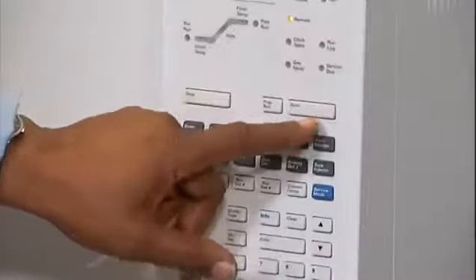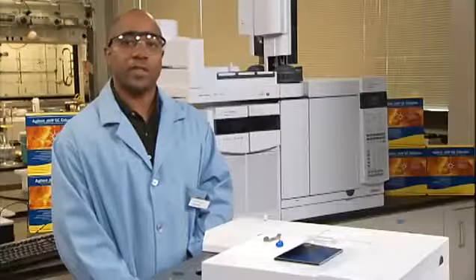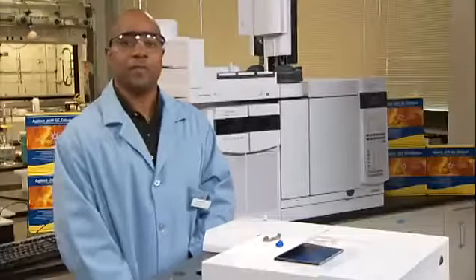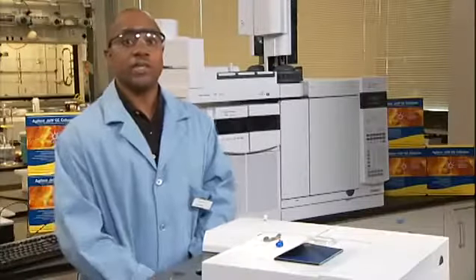Slide the locking tab to the back. Turn on the inlet. Allow the inlet and the column to purge with carrier gas for 15 minutes before heating the inlet or the column. Restore the analytical method.